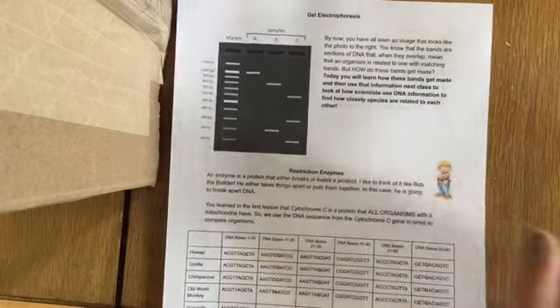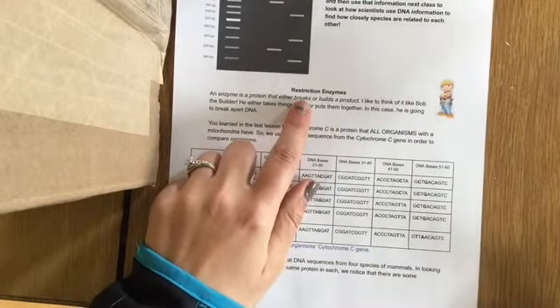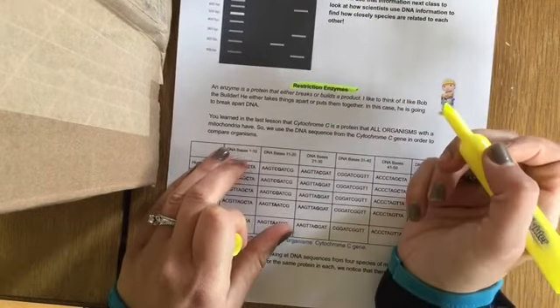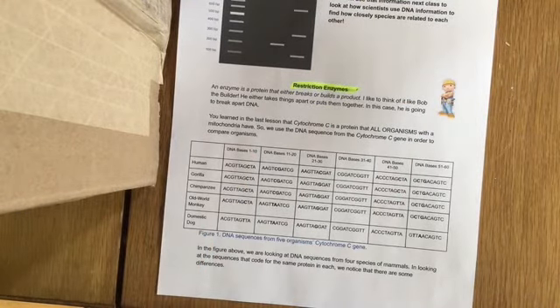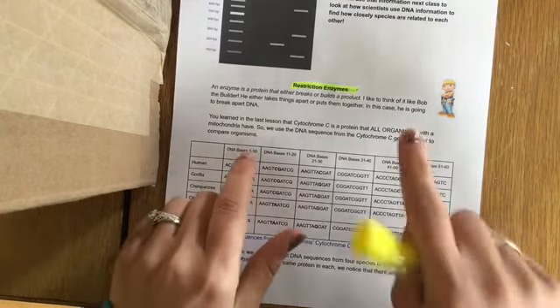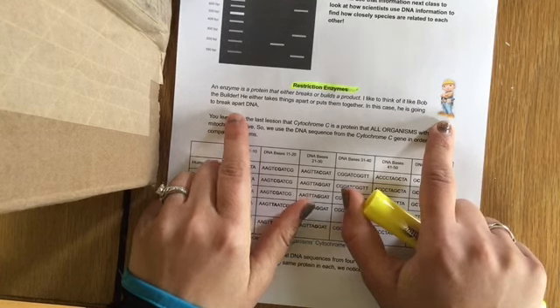They are made with a little something called a restriction enzyme. What a restriction enzyme is, it either builds something or breaks down a product. I like to think of it like Bob the Builder. So it either builds something or it takes something down.